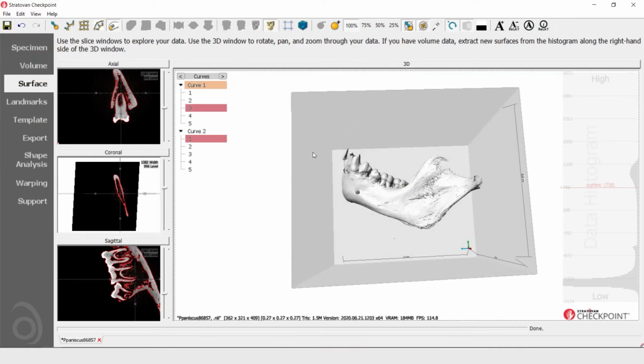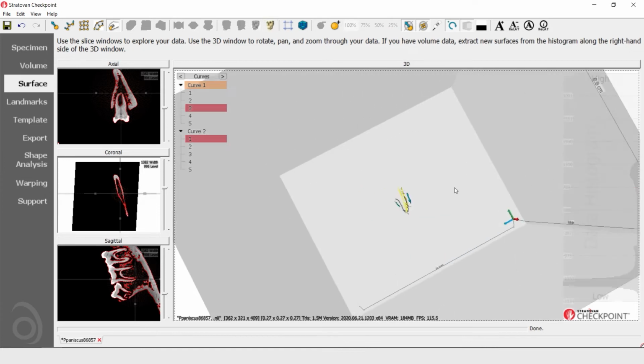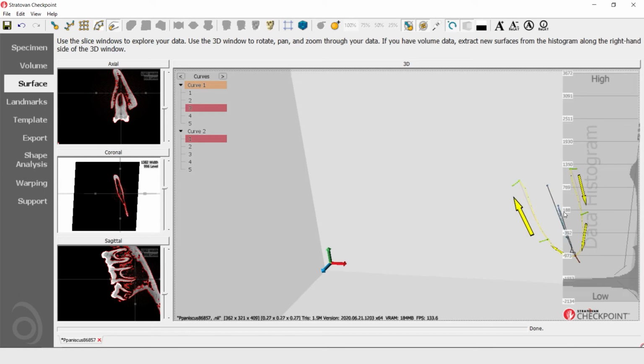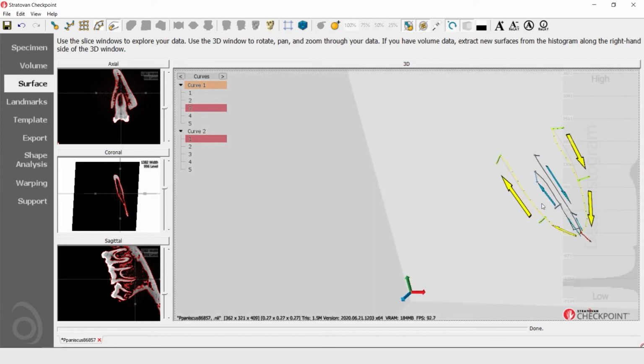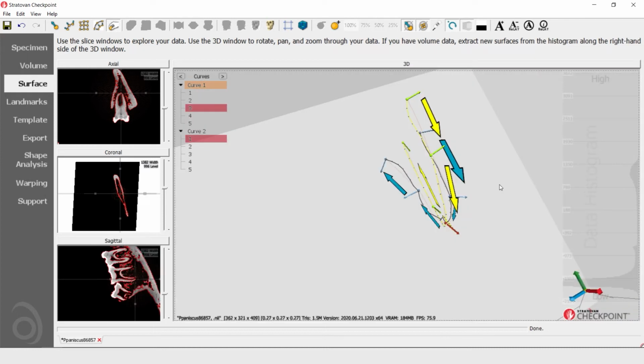We can look right here. We can actually have the curves viewable. So we can go in really close here and see those curves up close. And now you can see they look a lot better. Just by moving the tip there slightly this direction, the semi-landmarks for both curves now are adhering just to the surface of the root.